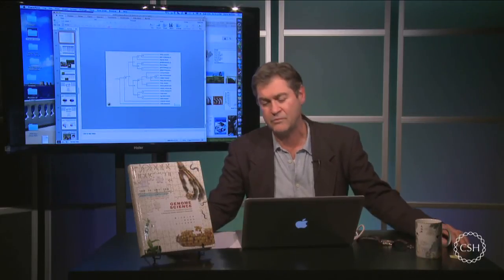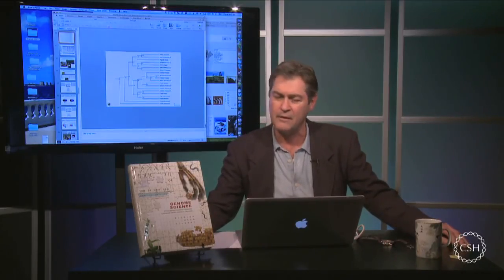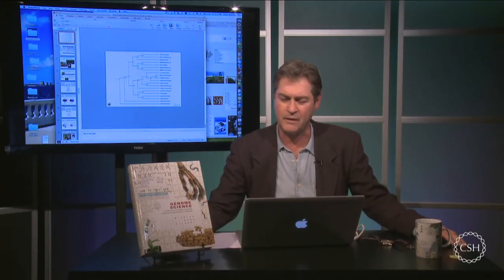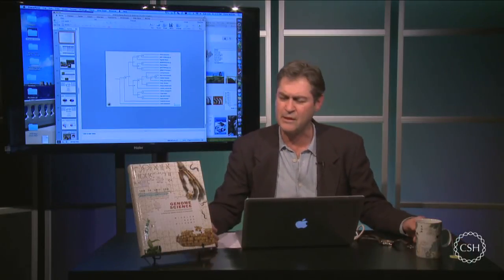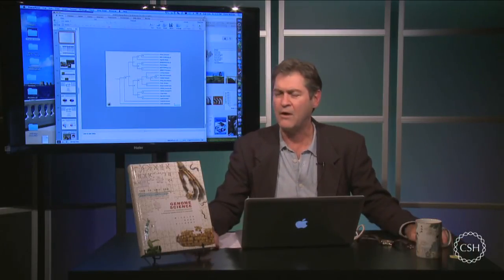Generally, we try to make DNA Subway have a high level of utility, but not do everything. So what I'd recommend is that if you really wanted to train students in using lots of different alignment tools, start with DNA Subway to get them limber and used to things, and then turn them loose on those other tools. And we find that this actually works very well.